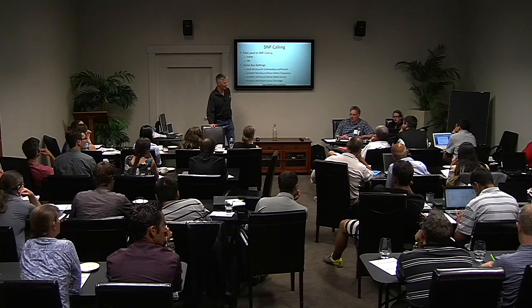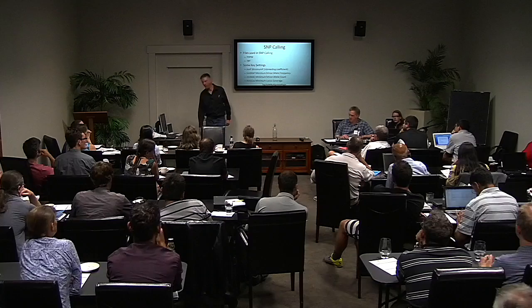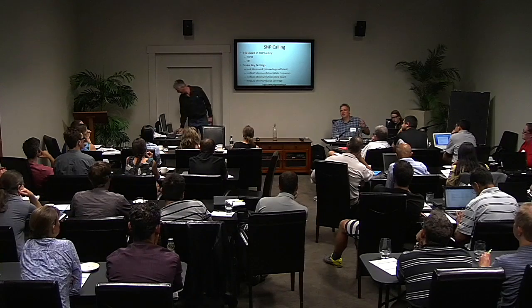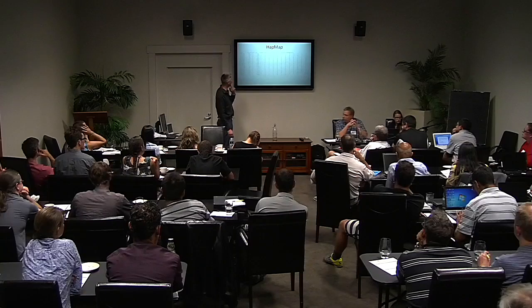Yeah, you do get overlapping, but we deal with that at a subsequent stage. There's a merge duplicate SNPs plugin that addresses that exact issue. You can get the same SNP read twice from different strands, from different tag loci. That's exactly the point John's making. And there's a plugin that deals with that.